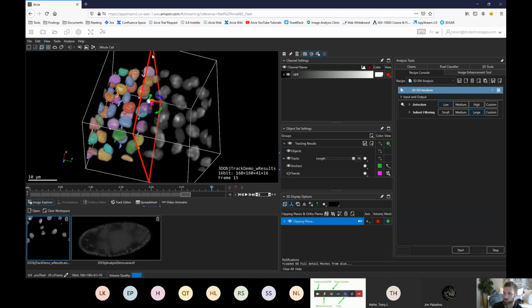There's a mechanism that lets you export a PNG of this viewer. Something to look out for when you do this: right now, this viewer is actually a very small part of my screen. And I want to show off my data. I don't want it to be something in the backdrop. So whenever it comes time to save images, I like to maximize the size of my viewer based on the data I have in it. In that case, that means getting rid of this big panel here, because it doesn't really add any value whenever I want to save a screenshot.